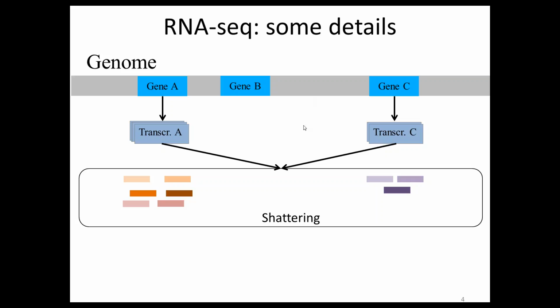And what's the technology? First shattering was applied. So we cut these transcripts into many small pieces. Then some adapters are ligated to these pieces.